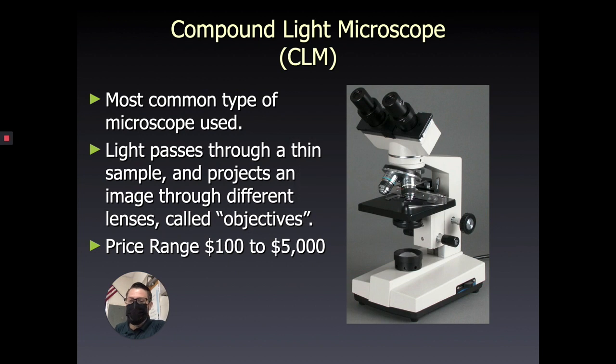Okay, so the microscope is an extremely important invention in terms of allowing biologists to do their work. A little bit later on, we're going to talk about some of the biologists that were influential in developing our ideas of life science, specifically in our understanding of cells. And the invention of the microscope was critical to their work. So today we're going to look at the different kinds of microscopes that there are. The microscope is a tool like anything else, and each kind of microscope is useful for a different type of job. So depending on what you want to accomplish with the microscope determines the type of microscope you'd want to use.